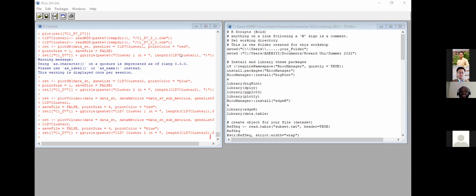All right. So does anyone have any question regarding this package? Okay, so I just had another question. Yes. So over here it says that the update prompt does not appear. It says packages not installed when version same as current.